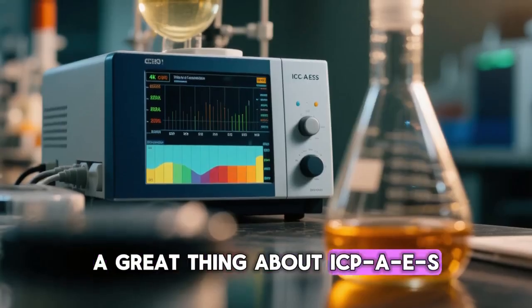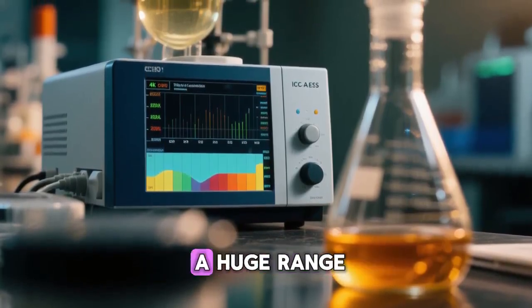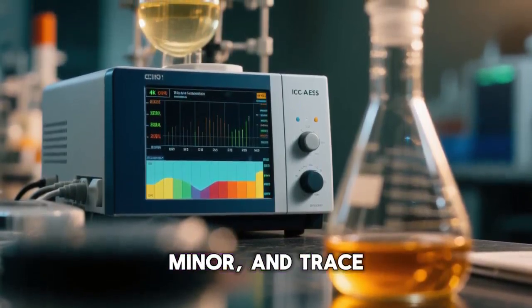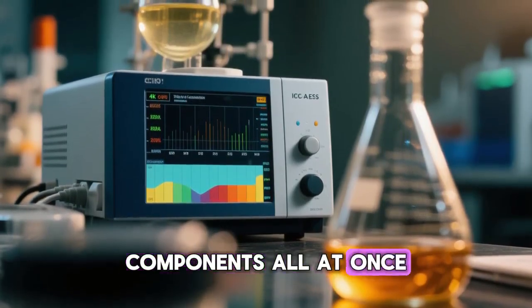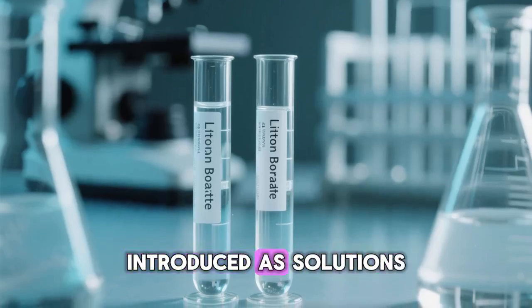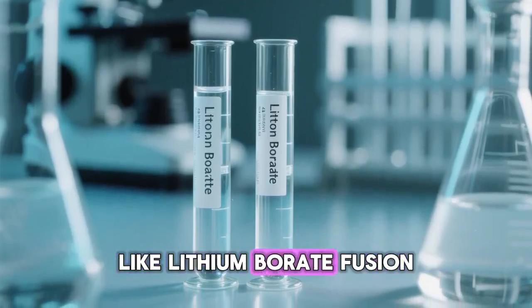A great thing about ICP-AES is that its calibration curves are linear over a huge range, meaning we can often measure major, minor, and trace components all at once without needing to dilute the sample. Samples are typically introduced as solutions, usually from a total digestion like lithium borate fusion.